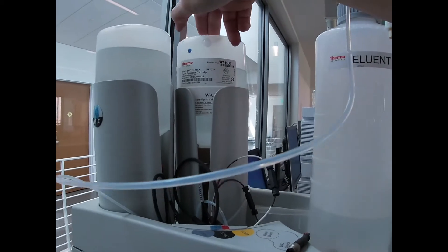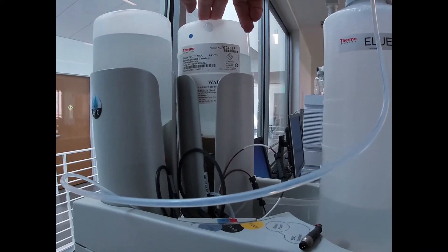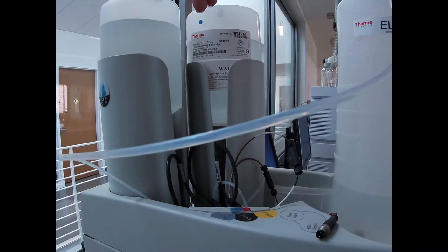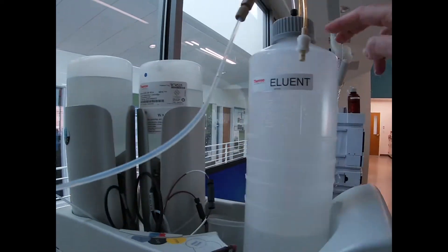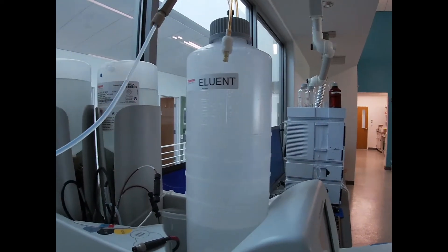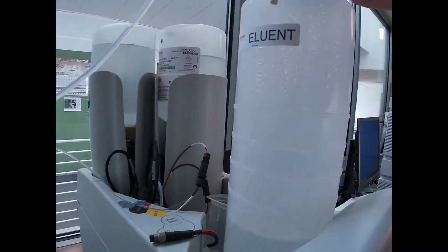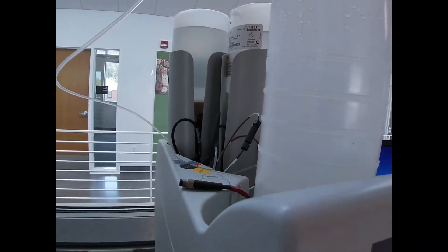This is an MSA cartridge, methyl sulfonic acid. We use that if we're doing cation exchange. This one is potassium hydroxide, so we use this one when we're doing anion exchange. And then this is full of high purity water. It's mixed with our eluent to actually put it at the concentration that we want.